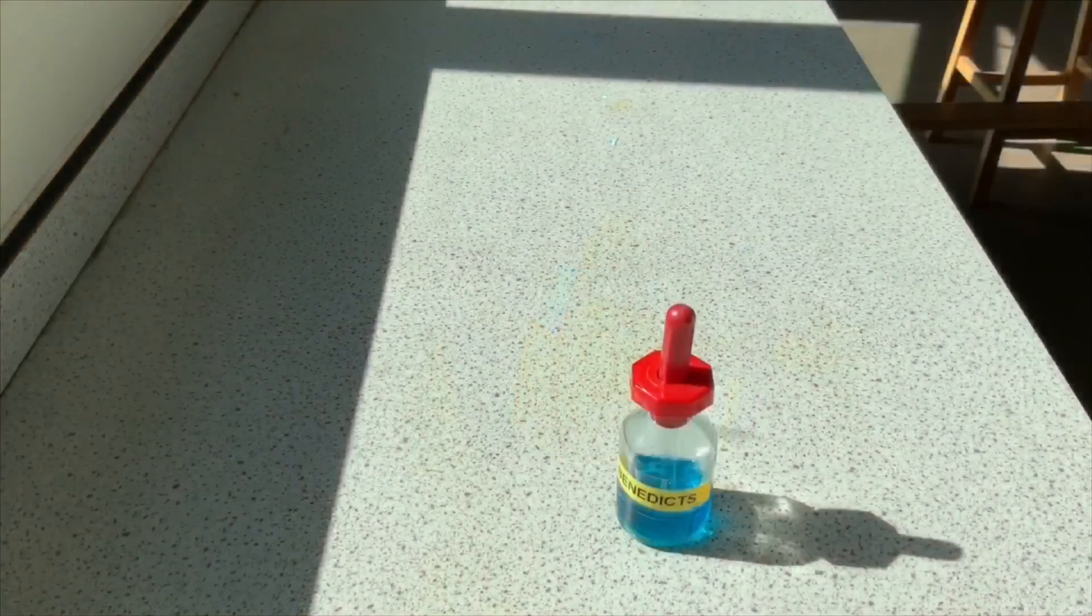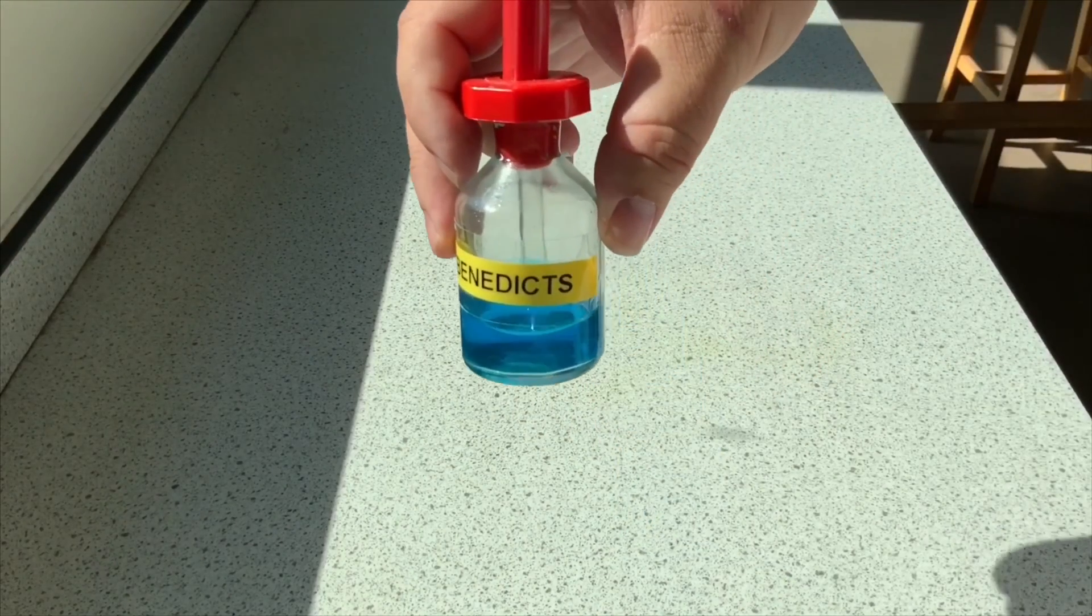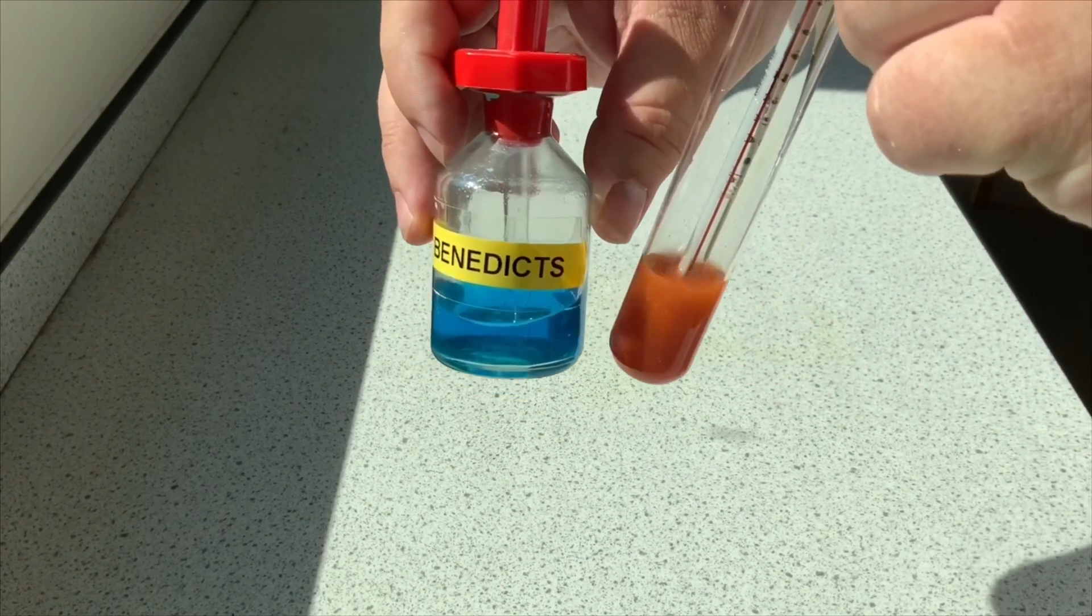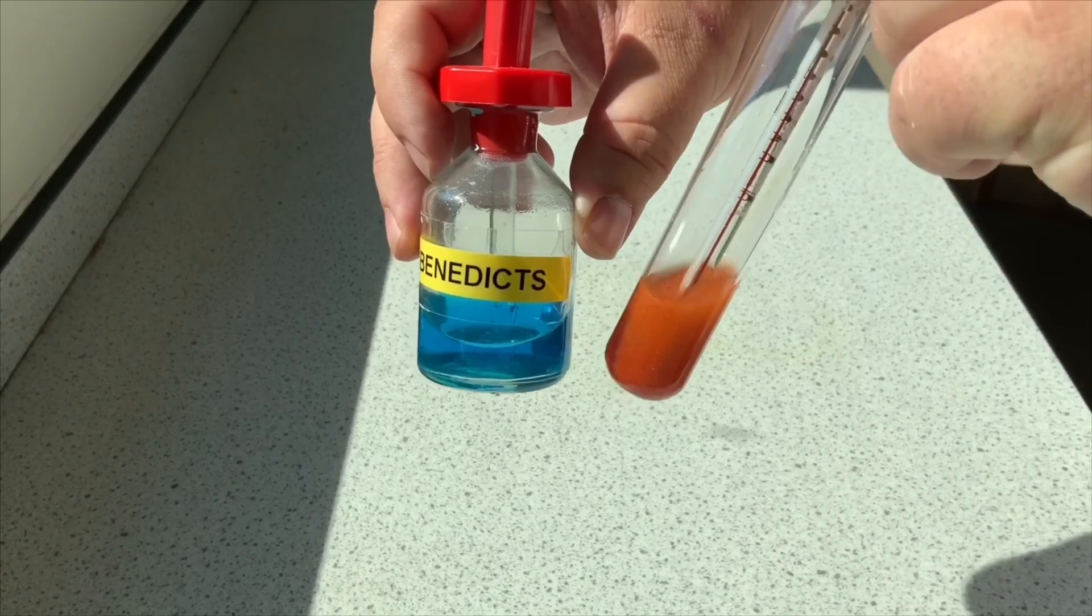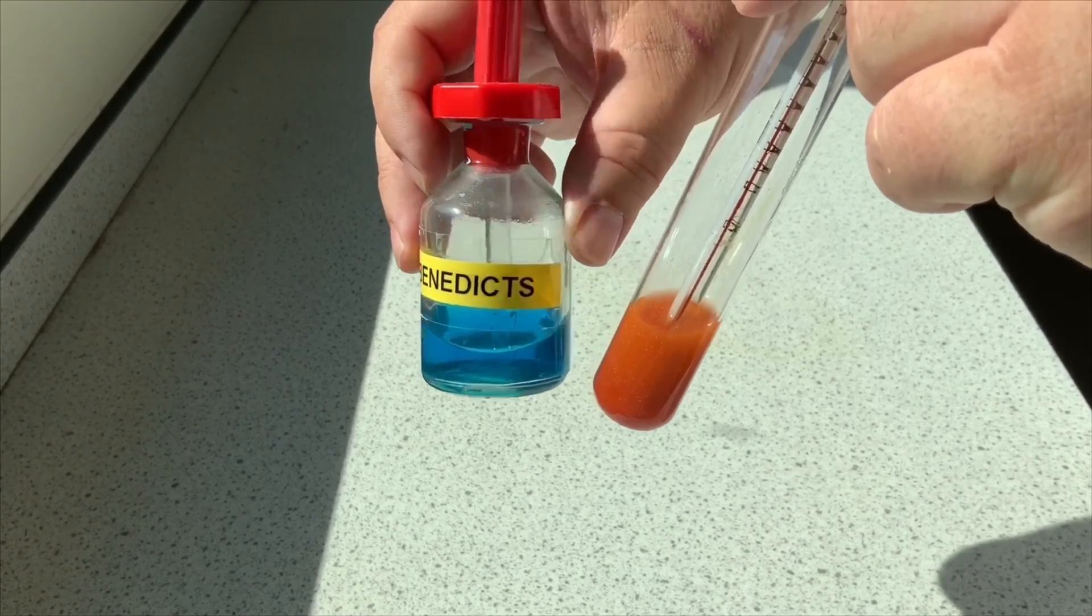We know there's a lot of sugar present because we put a lot of glucose inside. So that's the color of Benedict's, and if you look at the boiling tube over here we can see it's almost like an orangey brick red color.